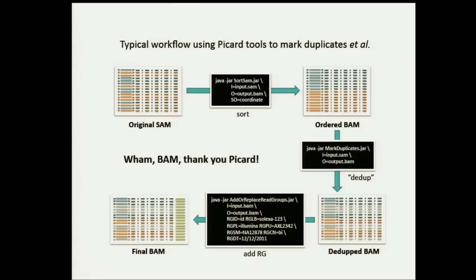All of this information is also very important, and sometimes in one BAM file, even though it came from one sample, it depends on the sequencing center you're talking about. Here at the Broad, it's all processed for us, so it comes all identified, and per-BAM files have their own read groups, and then you combine them all. But you may have one sample that was sequenced over 20 different machines, and you want to combine them all into one BAM file. So you need to add a read group to each one of these runs and then combine them all. To combine them, there's also a Picard tool to combine BAM files. It's pretty straightforward, and it'll combine the read group information as well. I hope that answers your question.